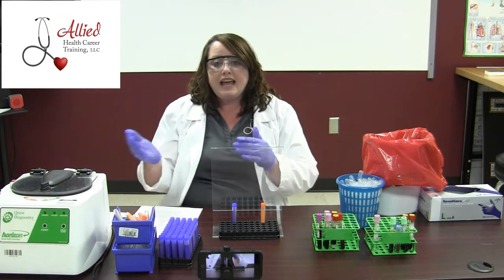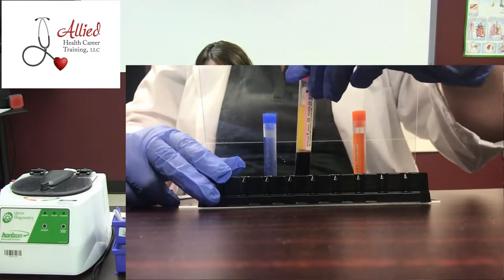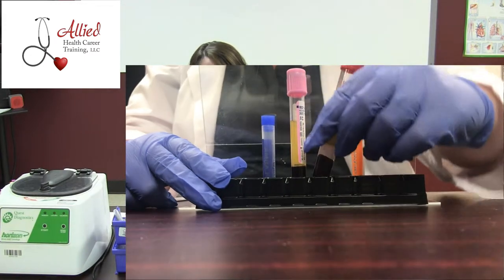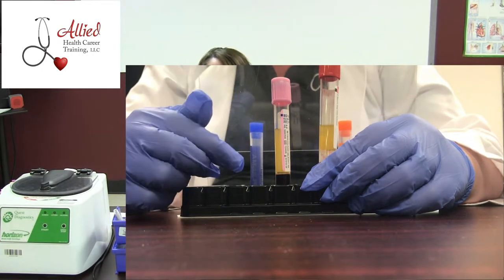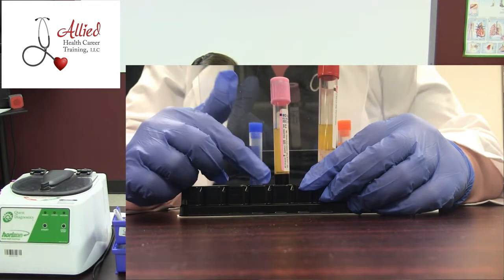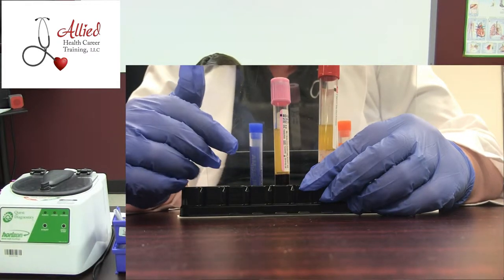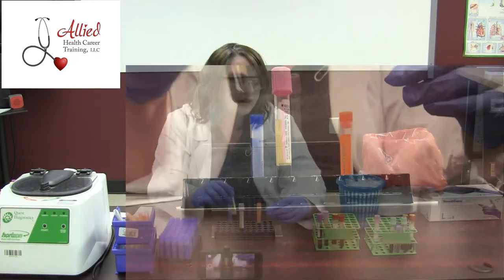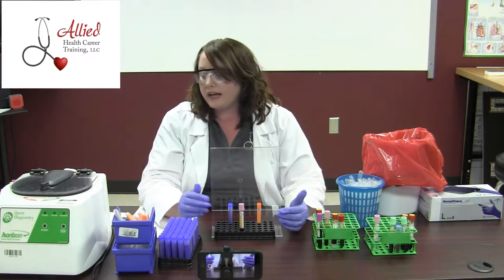Once you take your specimen out, the transformation has begun. The thing we have to worry about is we can't leave plasma and serum sitting on our red blood cells. We have to do what's known as aliquoting, because once you leave them on there, that starts to change the blood, the plasma, and the serum. Now some tubes have a really cool gel barrier, which is going to be very helpful when you're doing aliquoting.